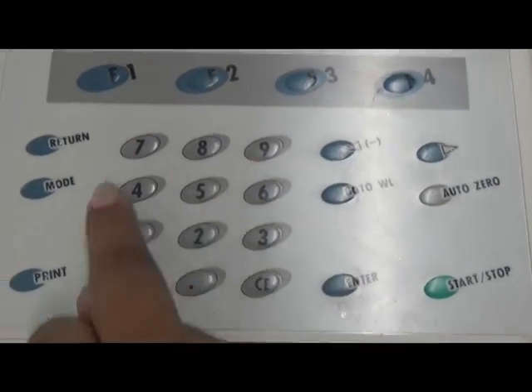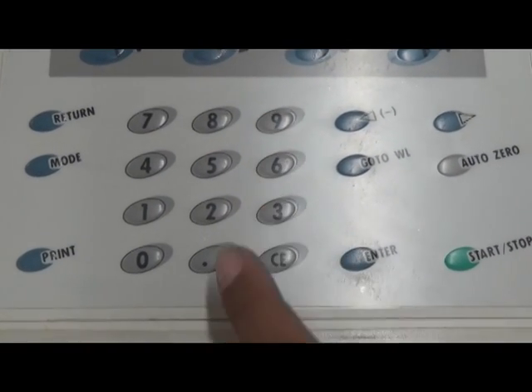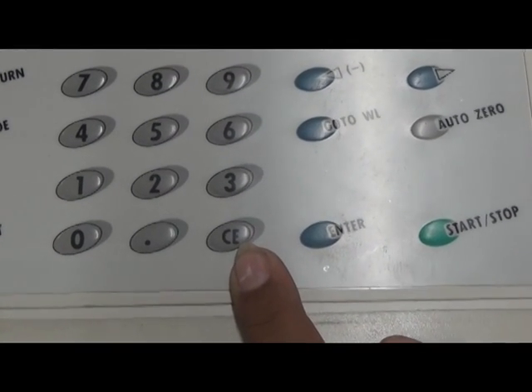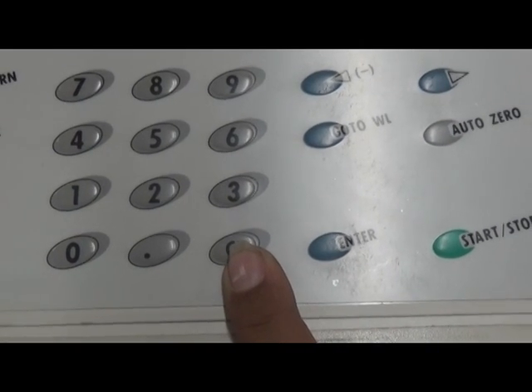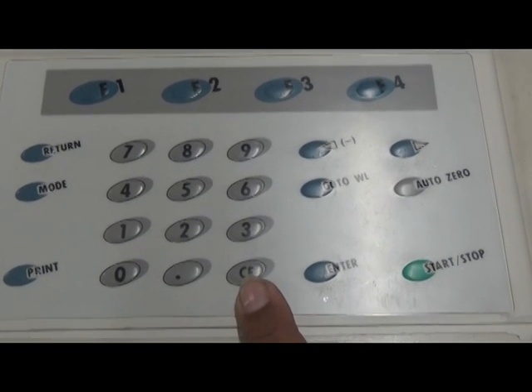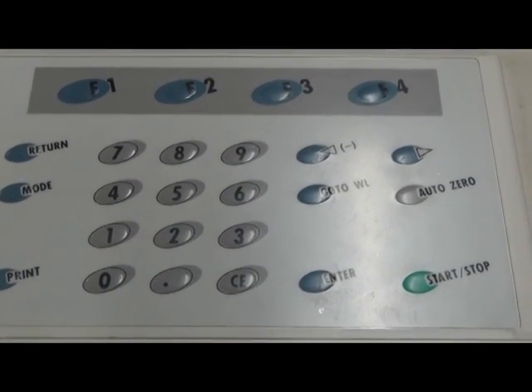These are known as numeric keys. Use these keys to enter numeric values. This is the last key, the CE key. Use this key to clear a numeric value entry error. When you press this key, the numeric values which have been displayed will be cleared and then you may re-enter the appropriate values. This is all about the keyboard.